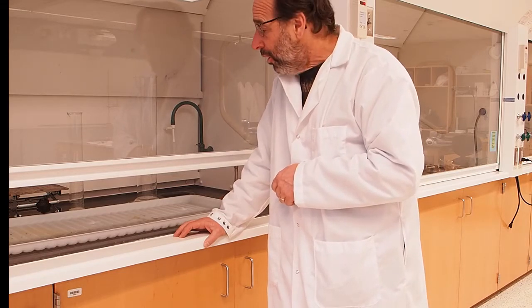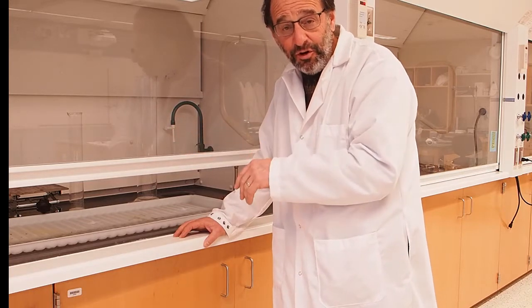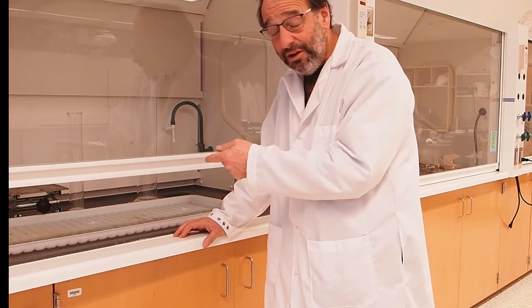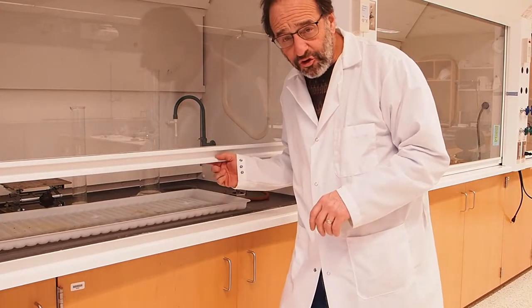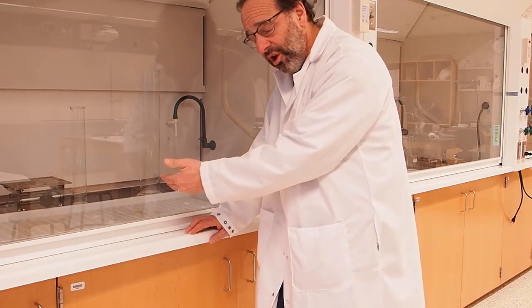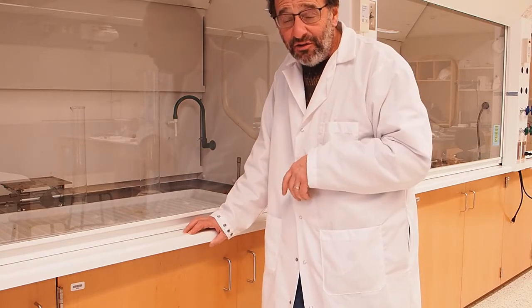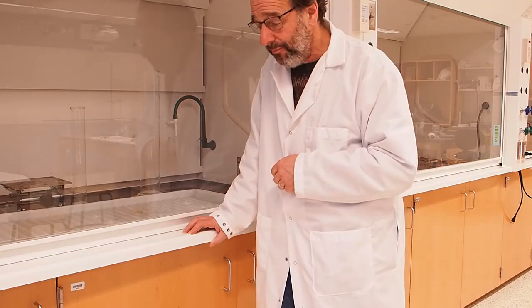When you do this, you treat this space as a common lab bench because not everybody has their own fume hood. So when you come in, make sure it's clean, just like you do for your lab bench, and when you leave working here, you make sure it's clean, just like your lab bench. Also, when you're done, close the sash, because if the sash is open, it drags more air out of the room and then out the roof of the building, which is not a safety hazard, but it costs money because we lose heat, particularly during the winter on a snowy day like today.